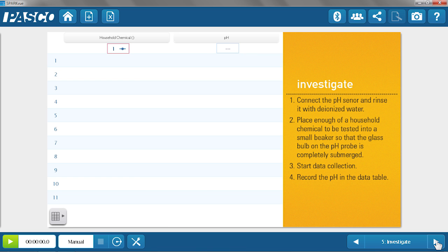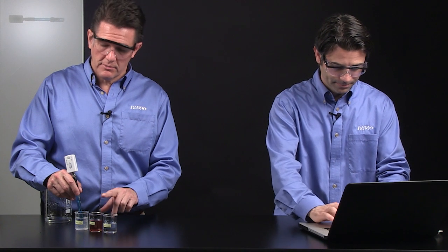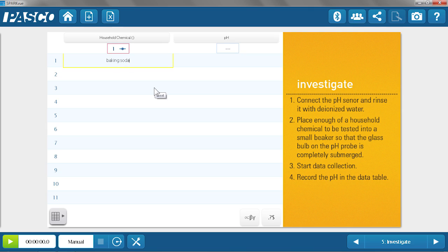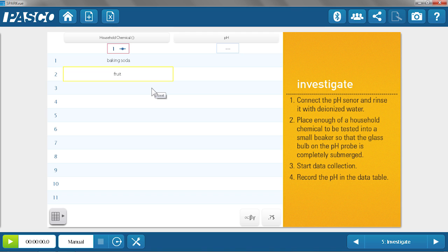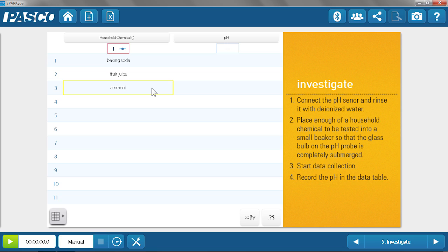And now we get right into the data collection. So this is organized as a table, so I'm actually going to organize myself before I start collecting all the data. Ron will tell me what chemicals we'll be testing. The first chemical is the baking soda solution. The second one is a fruit juice solution. And the last is an ammonia solution. I could add more or less chemicals here to this table. Right now we're going to stick with three.